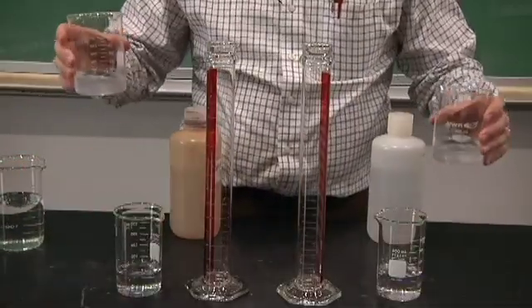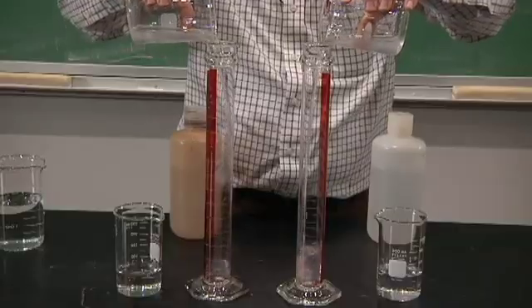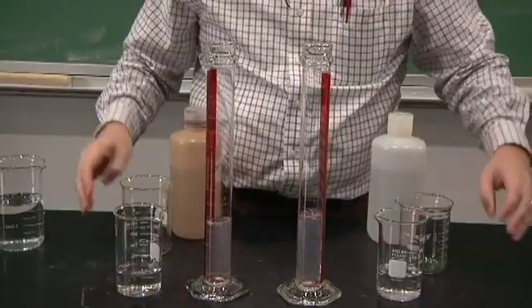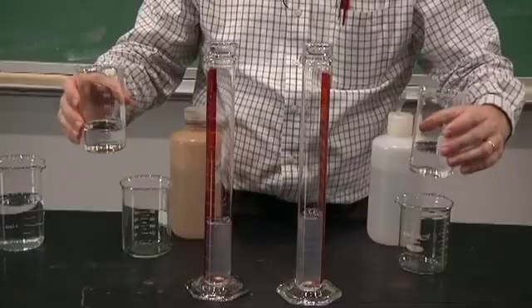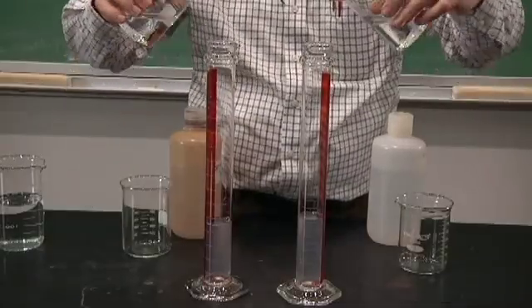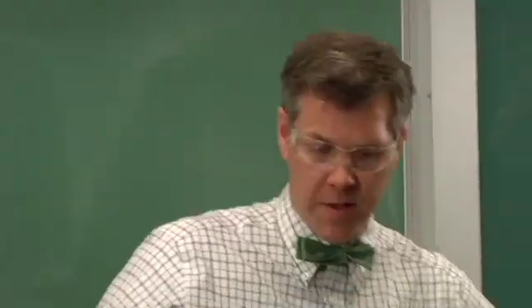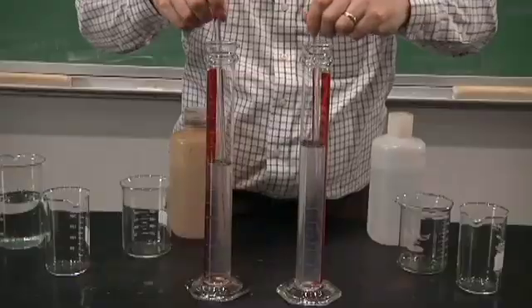So we begin our reaction by adding the first reactant to our tubes. And now just the same side we'll add our half concentration and full concentration. Quick stir to make sure that they're well mixed.